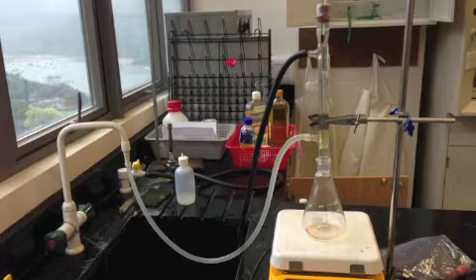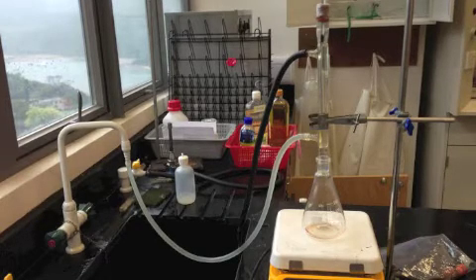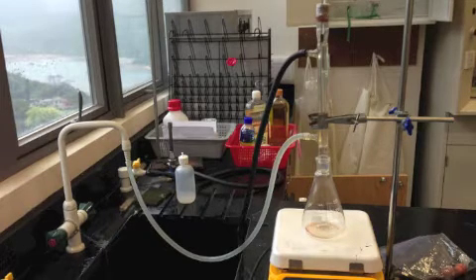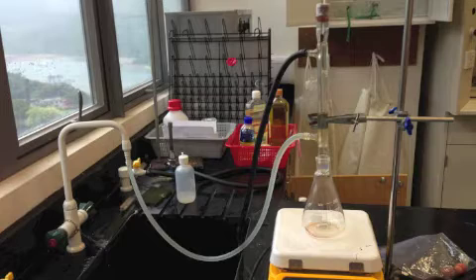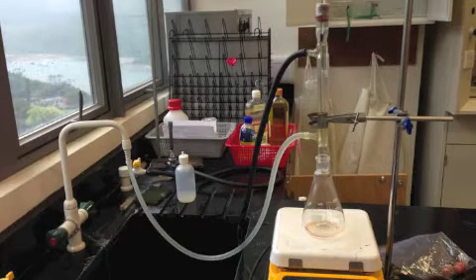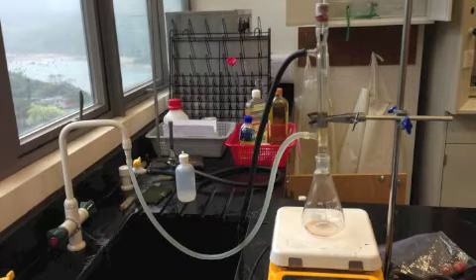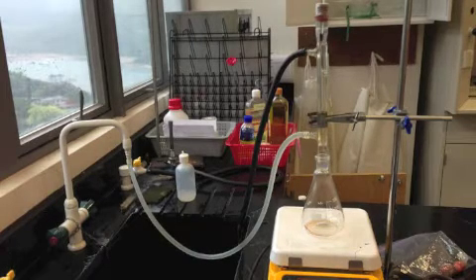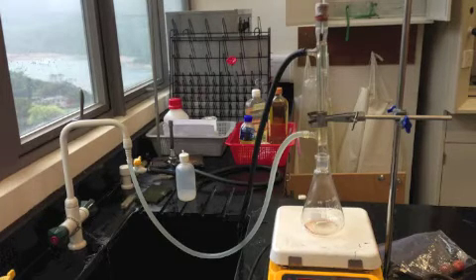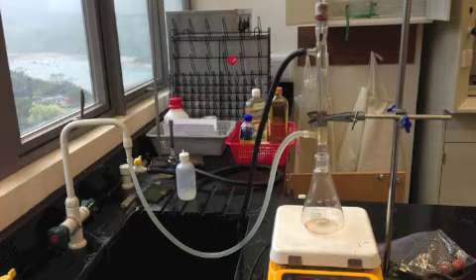The purpose of our lab was to mix alcohols with different numbers of carbon atoms in them with a carboxylic acid to determine effects of carbon number on distance scent would be detected. An important part of our procedure would be to react the alcohols with the carboxylic acid. In order to do this most easily, we left our procedure with generalized terms such as alcohol and carboxylic acid, such that we could use whatever substance was available at school.